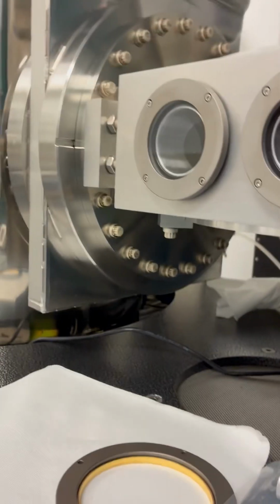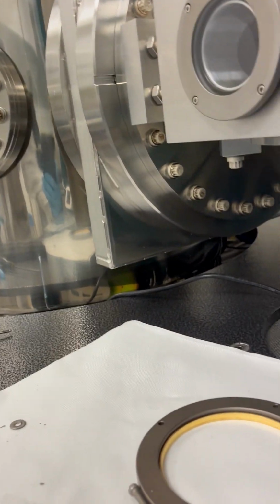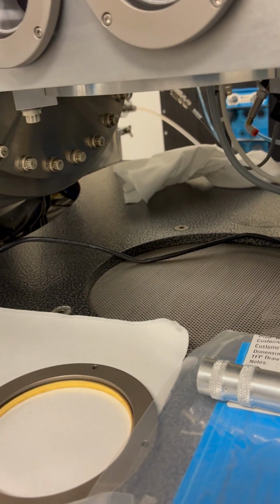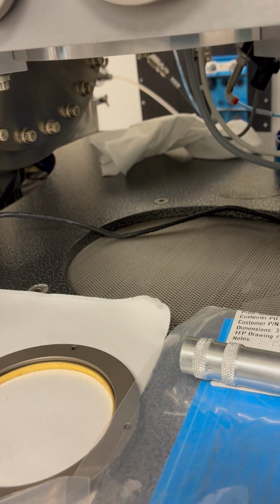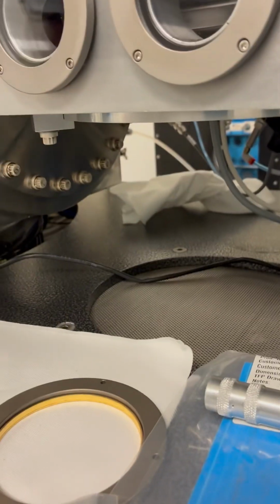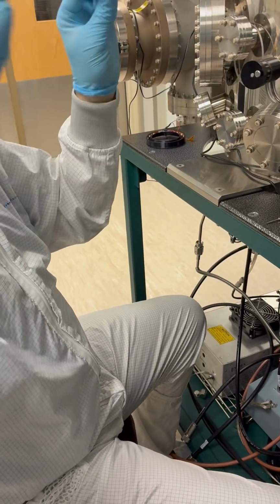Now, you see the transfer arm? It's got a lower level, and then it comes up to a shelf, and then goes up to the top. Okay, I'm going to want to place the sample holder right on that shelf.